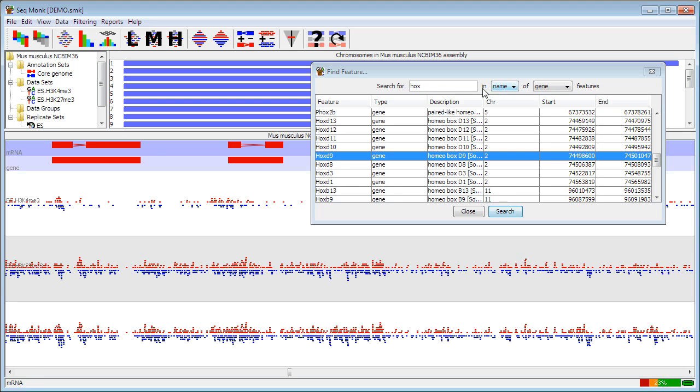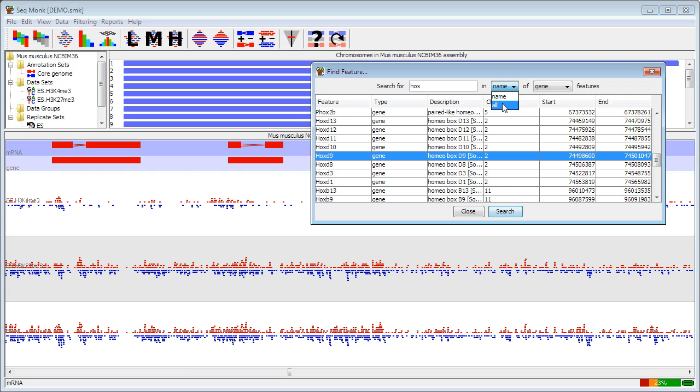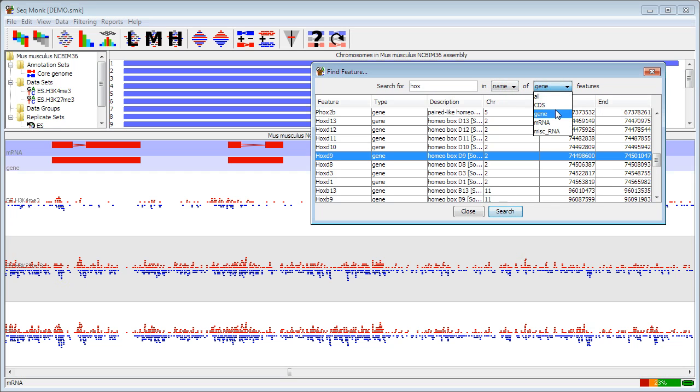If you want to do a search on something other than just the name of a gene, you can choose to search through all annotation for a particular feature rather than the name. And you can choose any of the feature types that you have available.